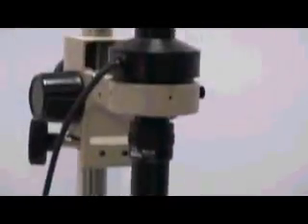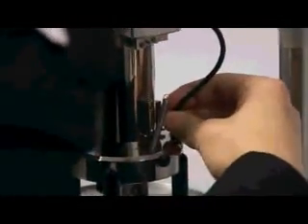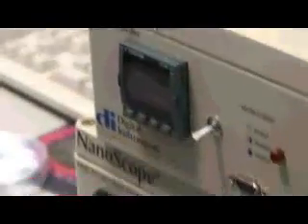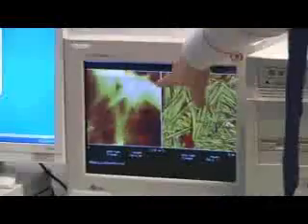Nanotechnology is not just about small sizes, it's about small forces or anything in the nanoscale. So we actually measure, for example, the forces between individual molecules. So say when two proteins come together, if you think about an antibody, that Y-shaped molecule grabbing something, we can measure those forces. So this microscope here, which actually looks quite small, doesn't look massive or anything, but it has the power to see individual atoms or individual molecules, and it can do it in liquids, which is the key thing for us. So this is an image.